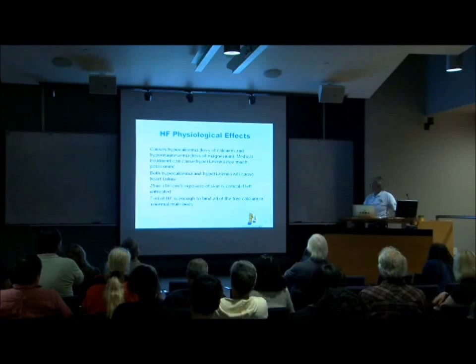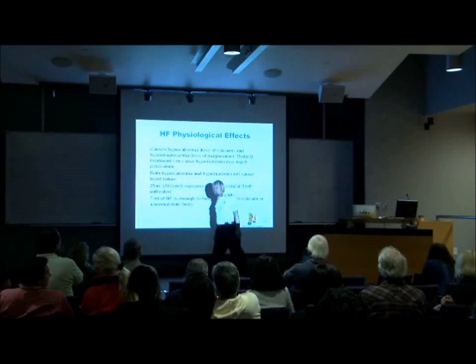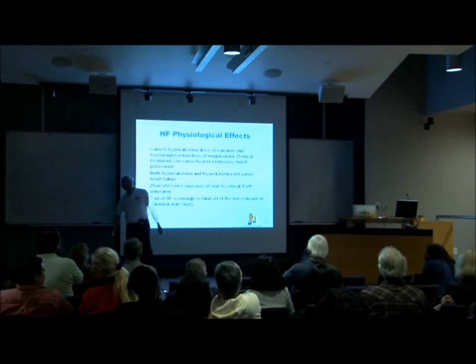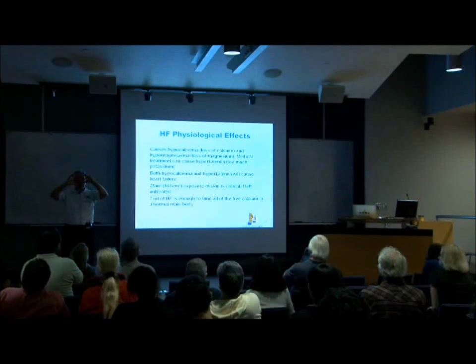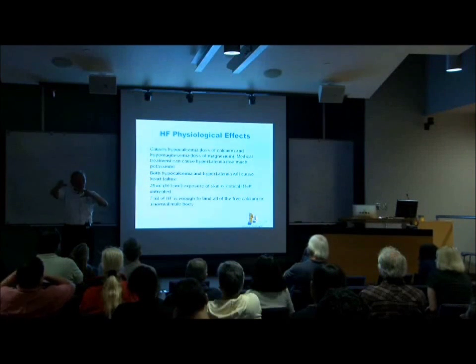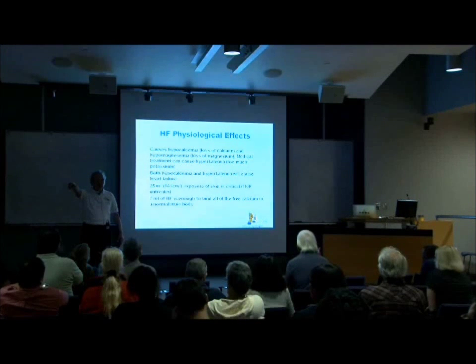They say if you have 25 square inches of exposure and you don't get treatment, you're going to die. That's essentially what you're saying. How big is that? That's about right, about like that. So let's say Doug gets splashed with hydrofluoric acid. What's the first thing you do?